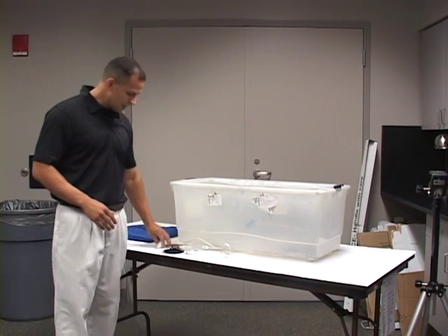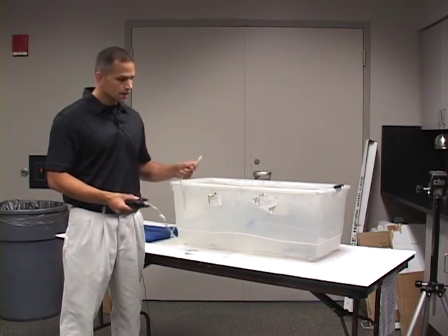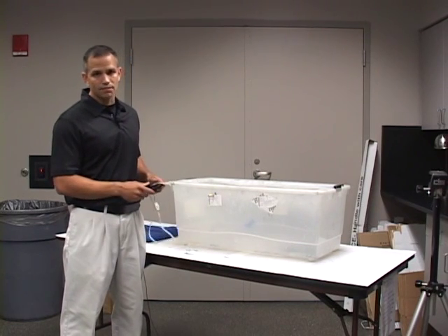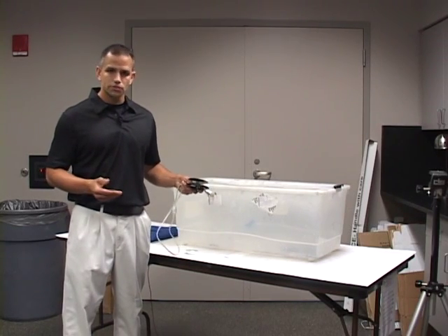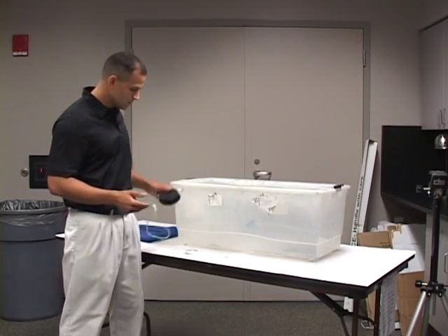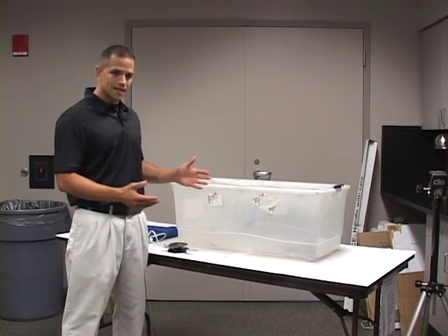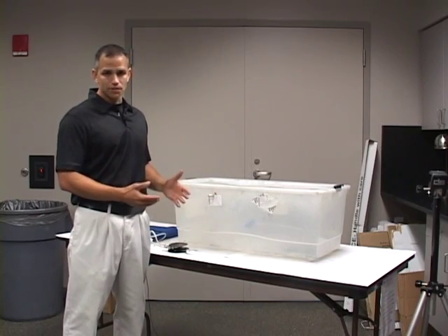The second issue is power. Your heating element in a classic fuming chamber requires electricity. If you're on a crime scene outside, you might not have electricity. If you're in a classroom, there may not be enough outlets for all your students to plug in their heating element. And number three is storage — if you have three, four, or ten of these, trying to find space to keep them is not going to be convenient for you.